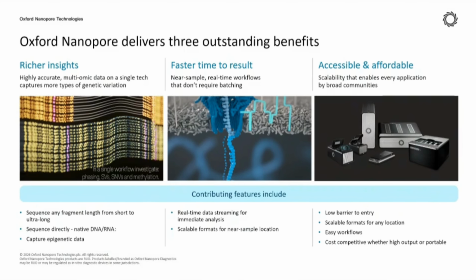We normally call Oxford Nanopore sequencing long read sequencing, but that is not quite accurate, because nanopore sequencing can sequence all the way from very short DNA fragments, perhaps a few tens of bases, like 50 bases or less than 100 bases, to very, very large DNA molecules up to megabases in size. So it is flexible in terms of fragment size and read length.